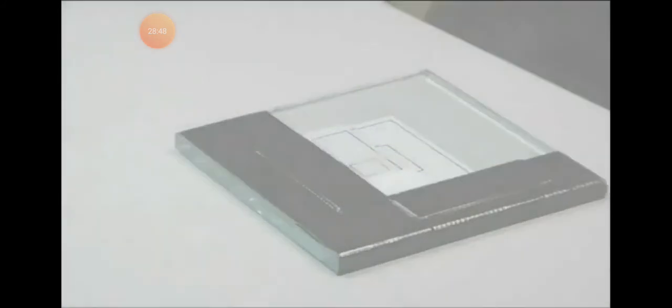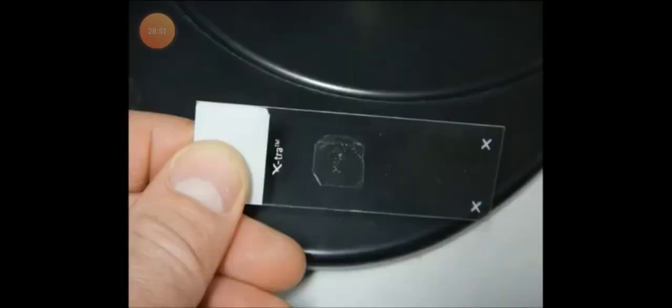The section remains attached to the slide and may now be stained or simply cover slipped as is, depending on the application in question. Several methods for staining embedded sections.